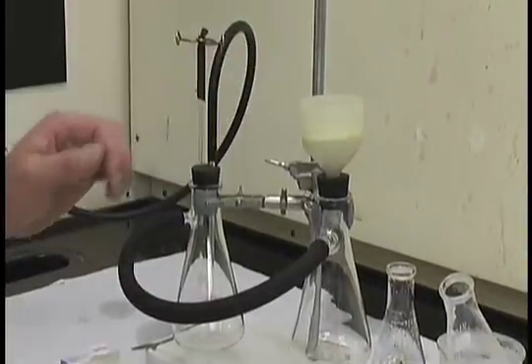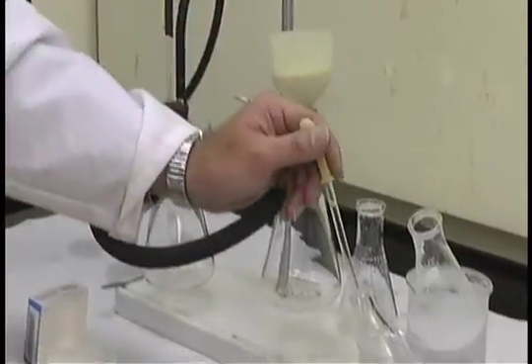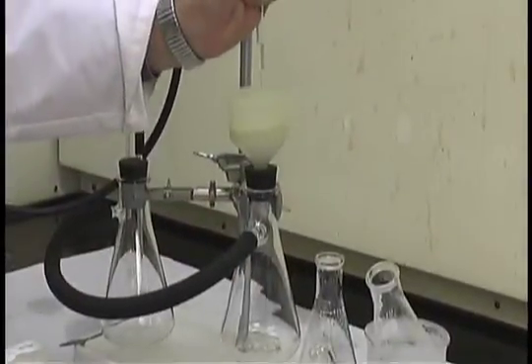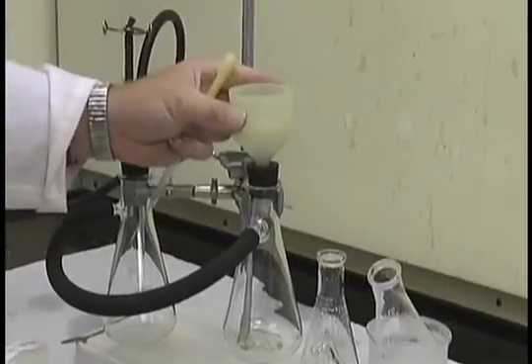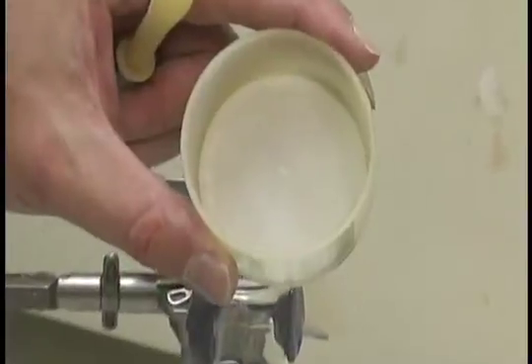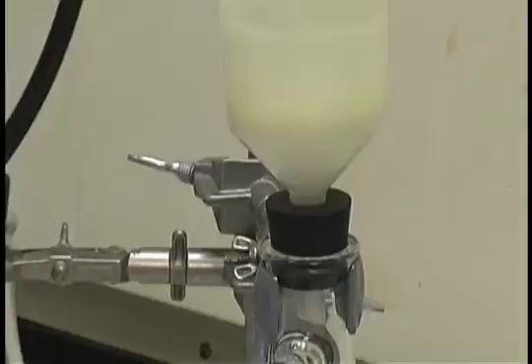Before beginning, we need to wet the filter paper so it is sealed to the bottom of the Buechner funnel. Using some fresh recrystallization solvent, simply wet the filter paper until it is sealed to the bottom. The vacuum will pull that filter paper down.